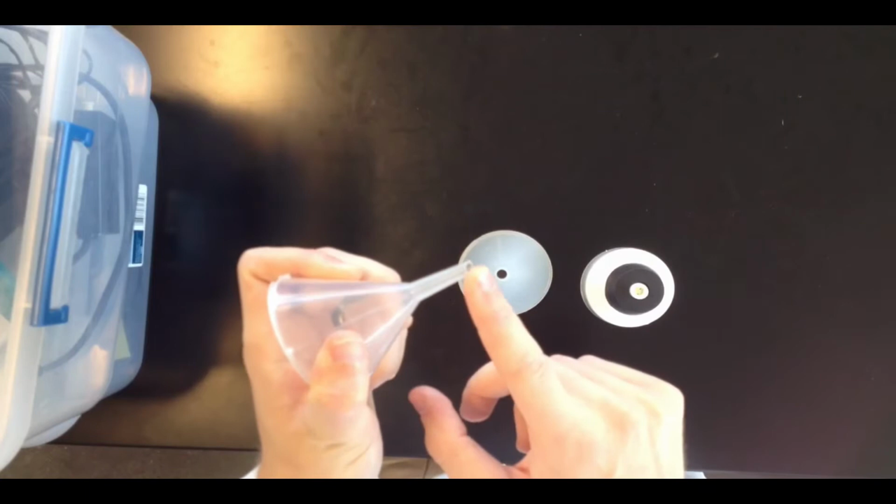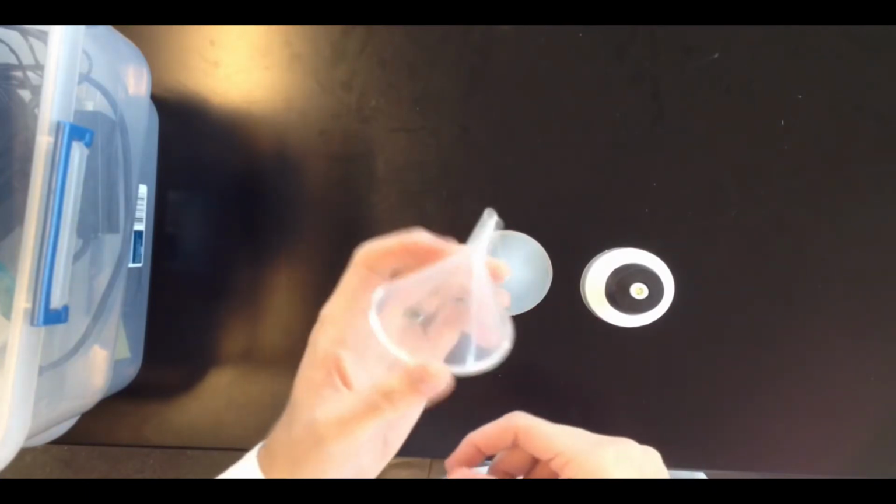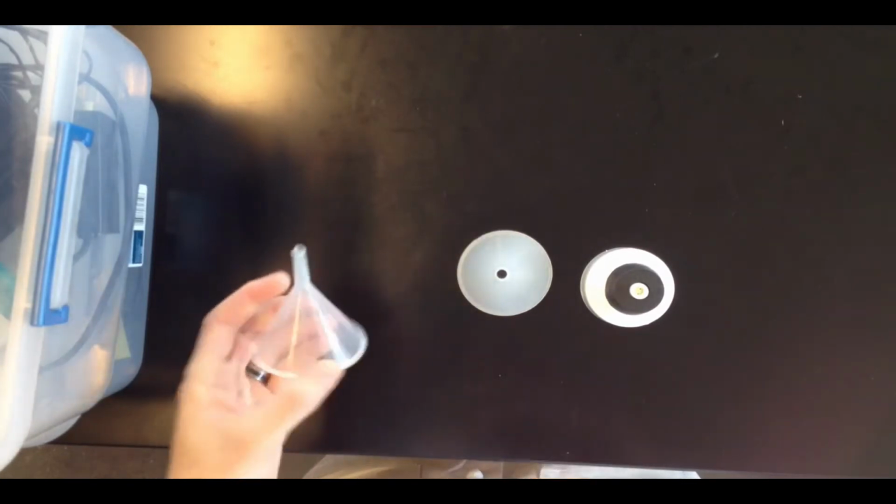Take a look at the bottom and look at the size of the opening. If it's relatively small, you know that it's for transferring liquids only and that it's a burette funnel.